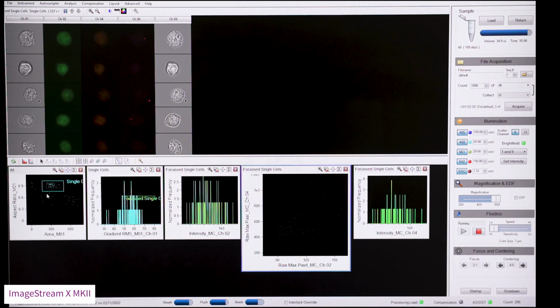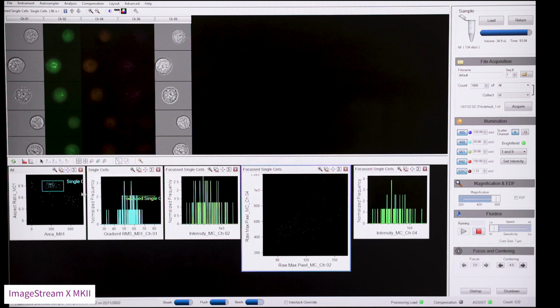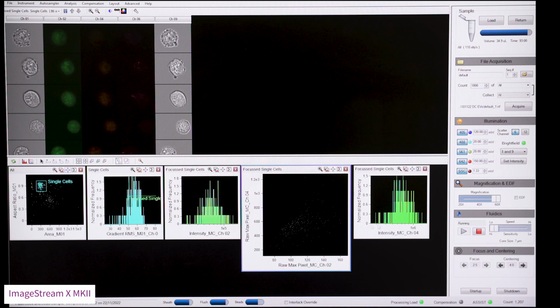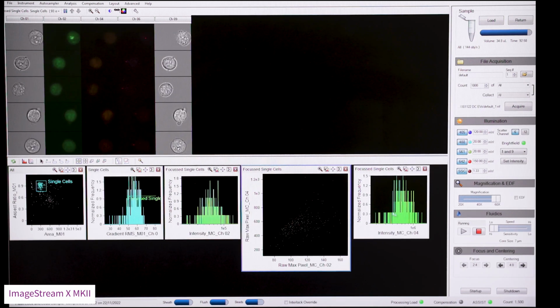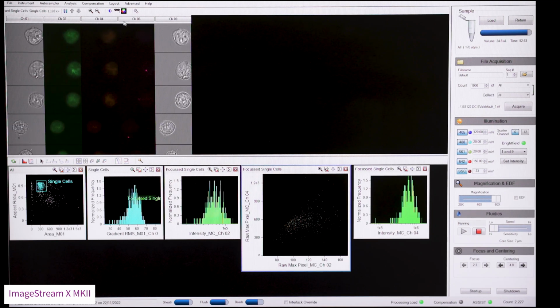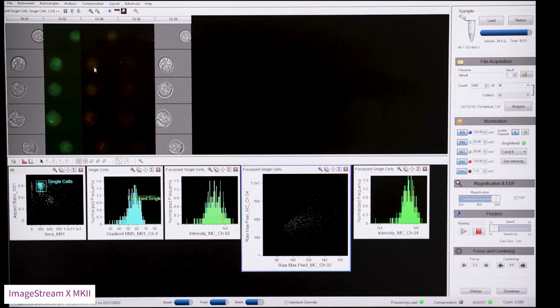The cells appear where we expect them in the area and gradient RMS plots. If we look at the intensity values of channel 4 for propidium iodide, they are of good brightness values, just below 10 to the 6. Now we can set up the image properties for propidium iodide.